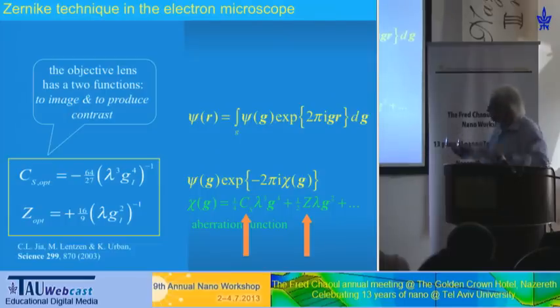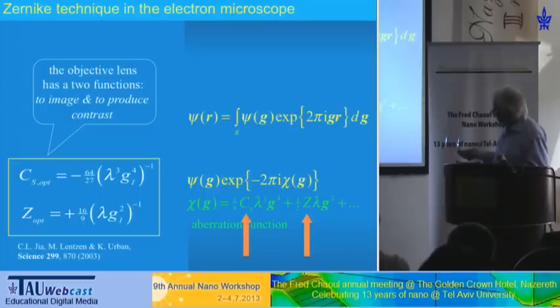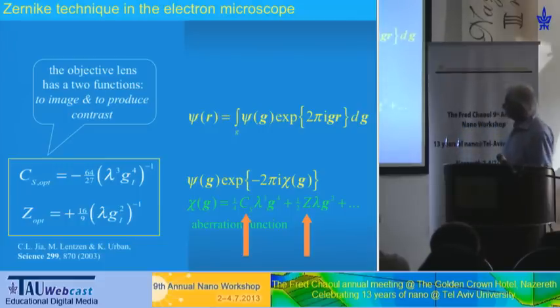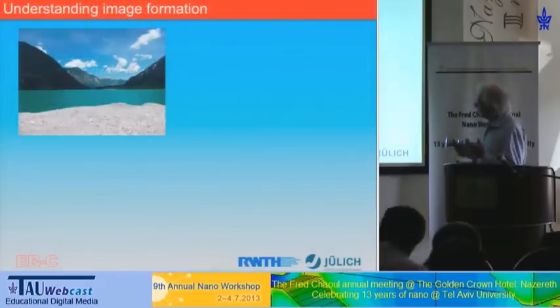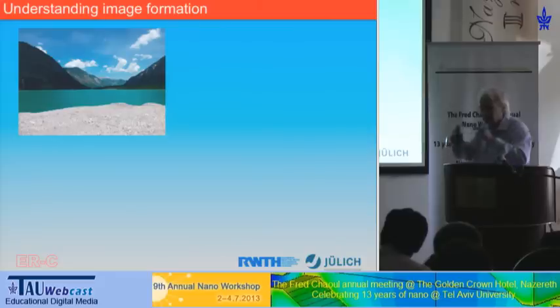This is the normal one. And then the second one is it has the duty to convert phase information into amplitude information. And that's done by defocusing and by some small spherical aberration value. So you see that's quite strange what you are doing in atomic dimensions, but we want to get access to the physics in these dimensions.